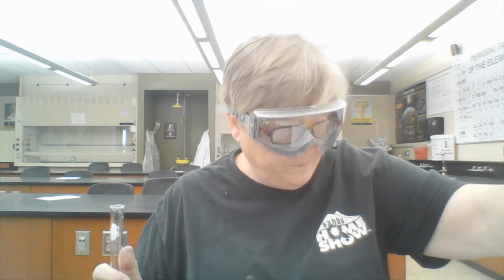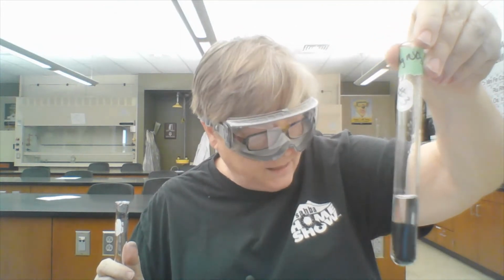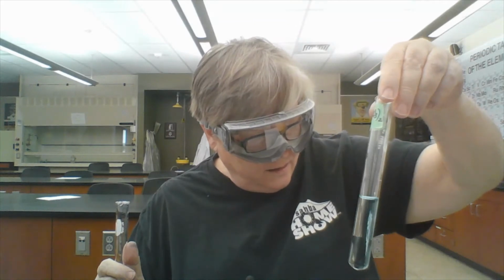I just realized that test tube number 1 was supposed to be silver nitrate and a copper strip instead of a lead strip. So we will do silver nitrate and a lead strip, and we will add that to our data at the end. We'll make this test tube number 7 with silver nitrate and lead. Now copper nitrate and lead, which is test tube 2. Clearly you can see that something is being deposited on that lead strip. Now I'm going to do the correct one for test tube 1.